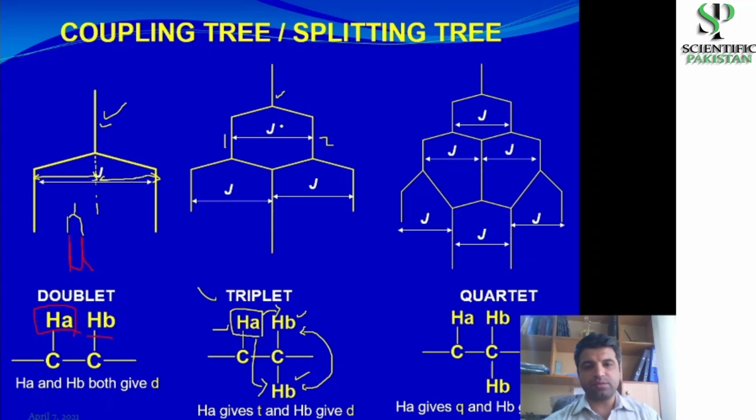So for example, the first splitting is equal to 8 Hertz.